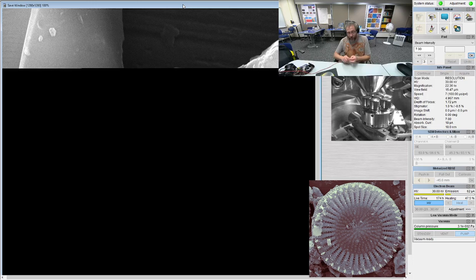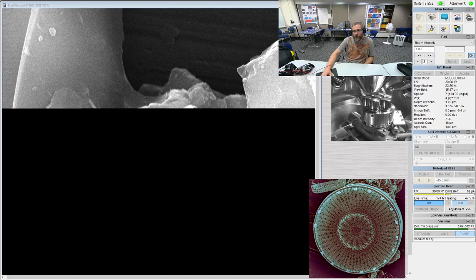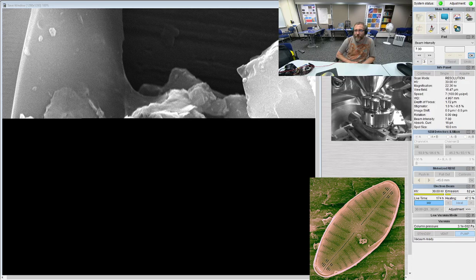I would say that if you went to the hardware store and bought some diatomaceous earth, because I have some in my house, and you sprinkled it on an SEM, you'd still see pretty good detail. It might not be quite as good as what we're seeing here, but in many cases it would be, and then you just have a lot more broken fragments. Otherwise, it would be basically the same. There's probably also a lot of variability depending on what deposit they got it out of. And also true, yeah, because that could have a huge range of ages.